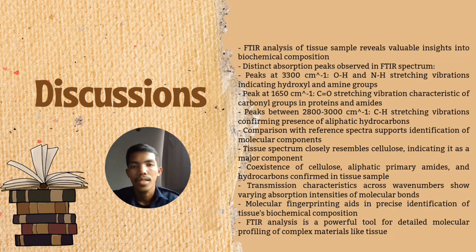Okay, for the discussion: FTIR analysis of tissue samples reveals valuable insights into biochemical composition. Distinct absorption peaks are observed in the FTIR spectrum. Peaks at 3,300 cm^-1 are the single bond of O-H and also N-H stretching vibrations, indicating hydroxyl and amine groups.